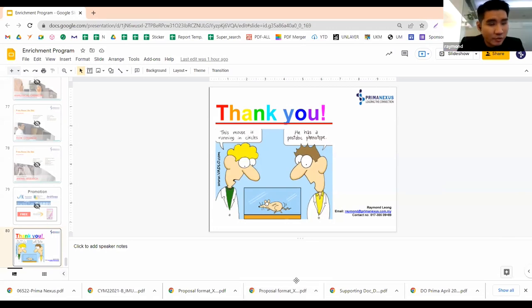Oh, okay. So let's say we are done with the lab mice. I assume the question is that we are done with the experiment. The terminal of the experiment is organ extraction, blood collection, and finally, you euthanize the animal, meaning that you give the animal a good way to die. Once they exit the trial, the carcass should be kept. So at the last day of the experiment, most of the time after our organ collection, we will pack the animals and then freeze them first. After that, we will prepare them for incineration, meaning proper disposal. Yeah, so I presume that this is the question.